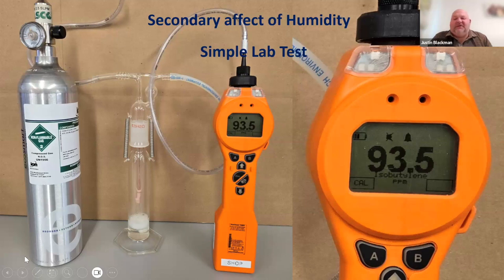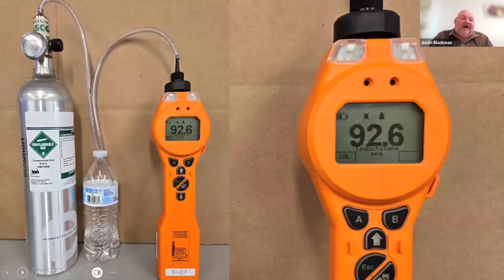You may say, oh, well, Justin, I don't want to spend hundreds of dollars on a bubbler to test this myself. Well, let me see. You can do a cheap version yourself. Go to the store, sacrifice the life of an inexpensive water bottle. You don't even need the air stone at the bottom.